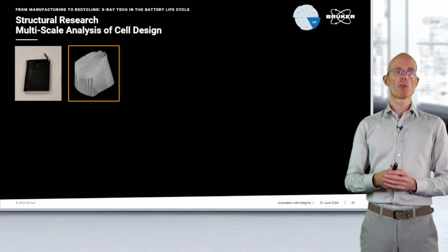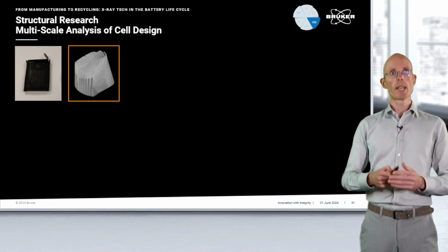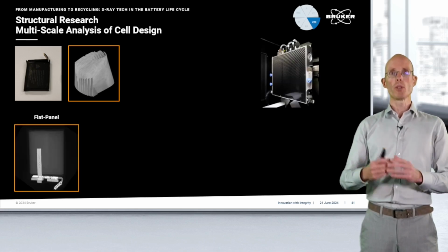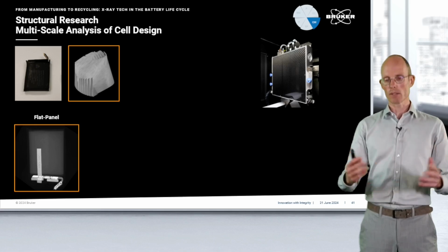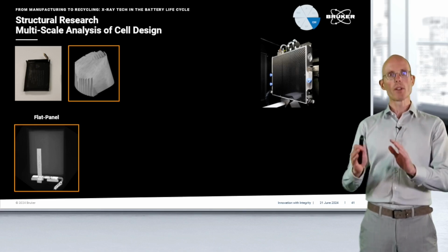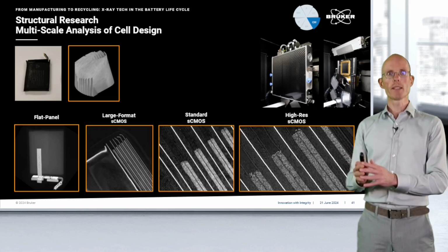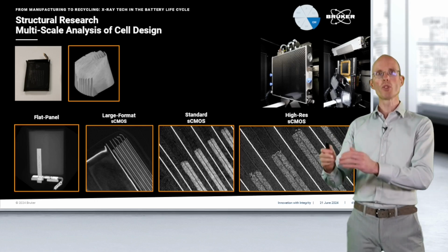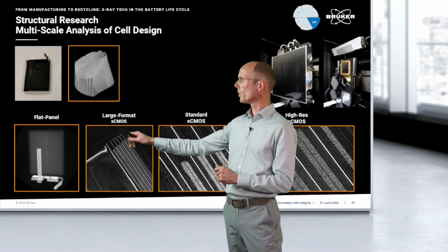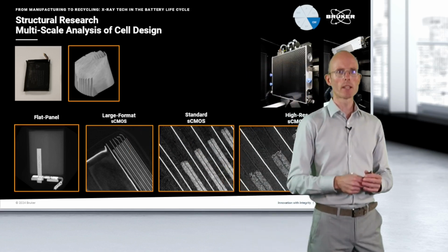So this is an example of a small pouch cell that's used in smartwatches, for example. Like in the previous examples, you can get an overview by using a large detector, scanning it at several microns, but you get a good overview of the complete structure. You can also define your regions of interest, and then with different detectors, increase the resolution at each step. For example, switching one detector, you already get a very good overview of the anode overhang. Also, the tilt angle is very well seen.